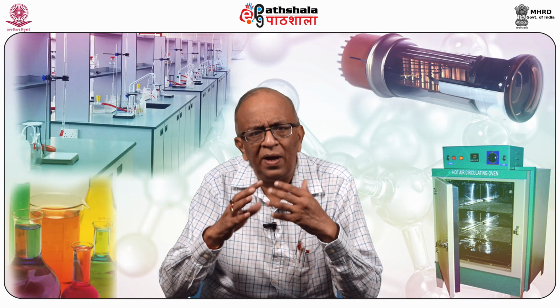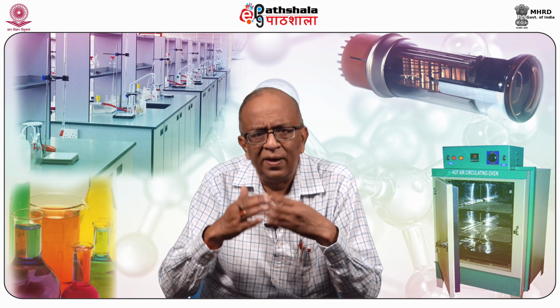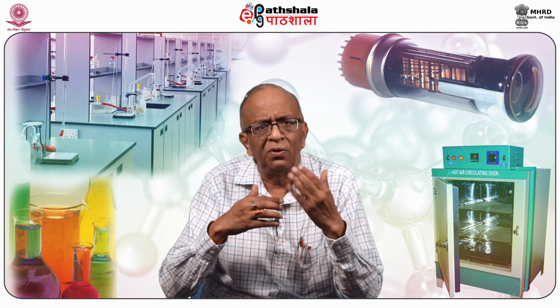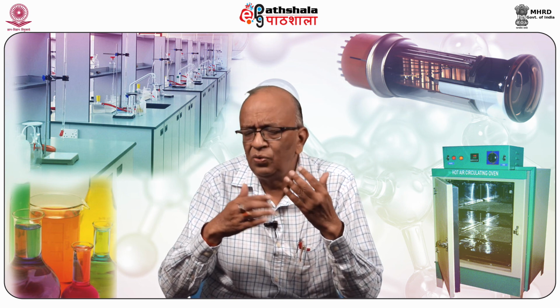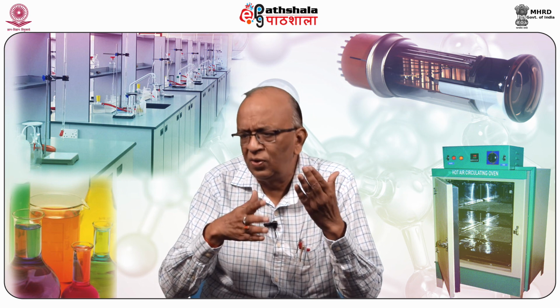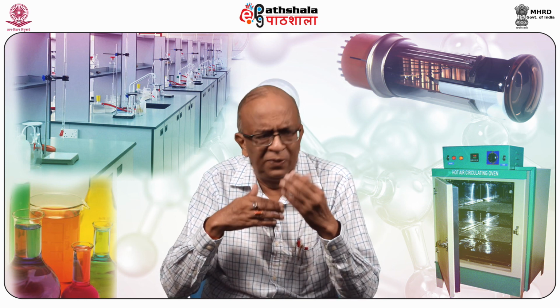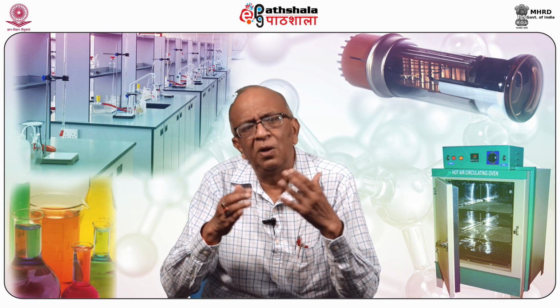Students, we have learned in this lecture what automatic analyzers are, what process control analyzers are, what their applications are, and how they can be interfaced, particularly in industries where there is a corrosive environment. The environment in industries is different from the environment in laboratories.